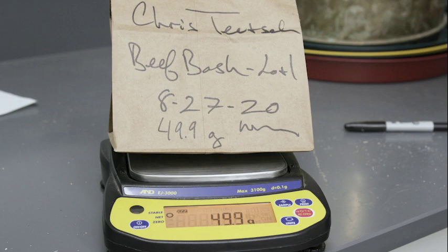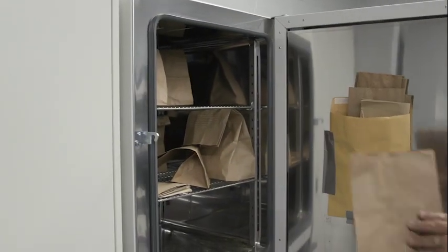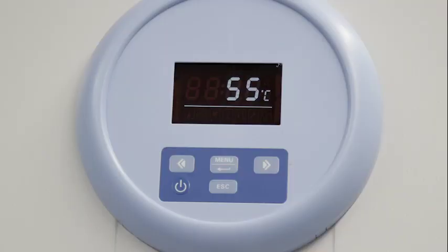Once we get the sample weighed, we'll place it in the dryer overnight. The dryer is set to around 55 degrees Celsius, which is the equivalent of about 130 degrees Fahrenheit. We'll dry it overnight to drive any remaining moisture off the sample, and then we'll be able to determine the dry weight of the sample. The reason we need dry matter on the sample is that all the rations are balanced on a dry matter basis.